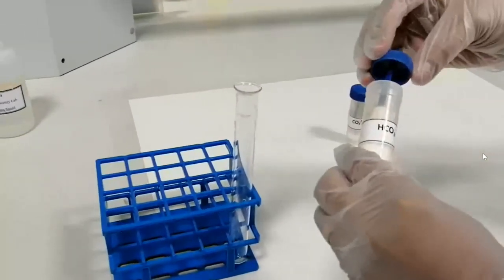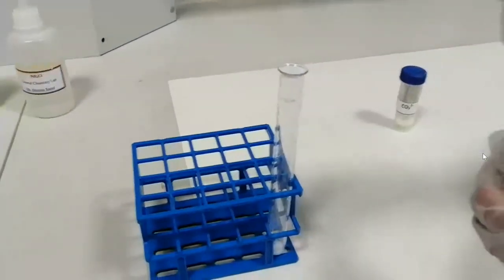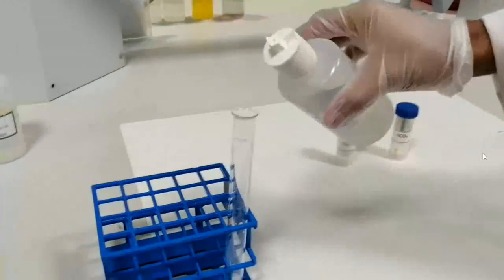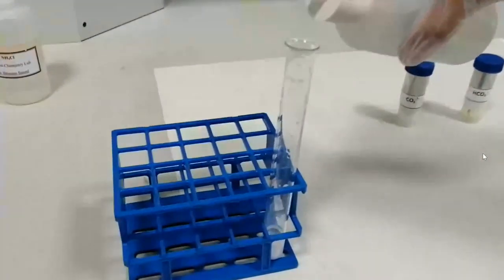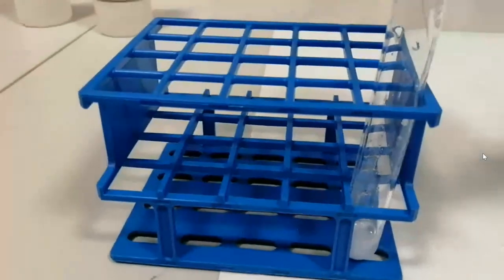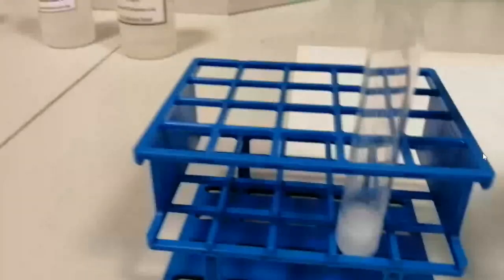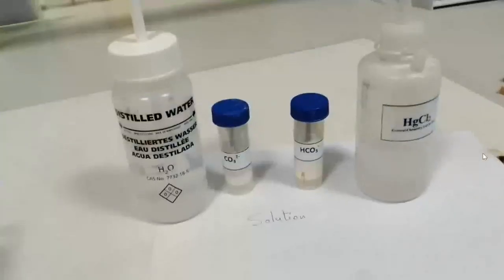The primary test for bicarbonate will be the same: in a dry and clean test tube, just add a few crystals and then add the group reagent, which is dilute HCl. You will see the same observation for carbonate and bicarbonate. Can you see the effervescence? And this gas which is evolving is carbon dioxide. Now we are going to do the confirmation tests.